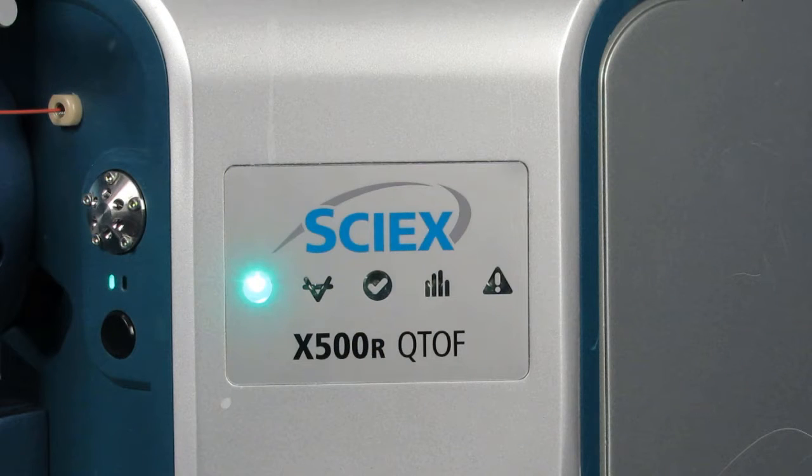Press and hold the vent button for 3 seconds. Allow the system to vent for 15 minutes. The turbo pump will spin down gradually.